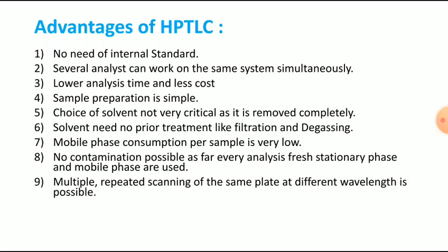See, these are actually the nine advantages of HPTLC. Rather than these, there are some other advantages also. Actually, HPTLC is cost effective and environmentally friendly as compared to HPLC, and on a per sample basis, solvent consumption is very less. Another advantage will be that sample cleanup is usually simple. Unlike column chromatography, the stationary phase is used only once.